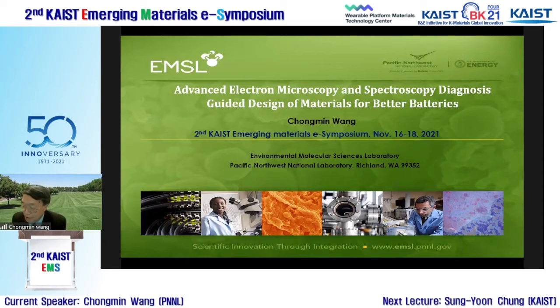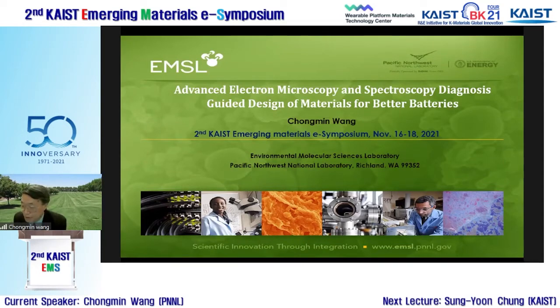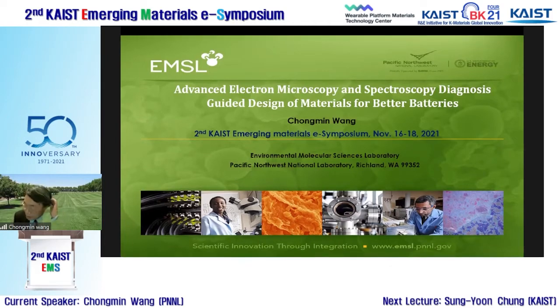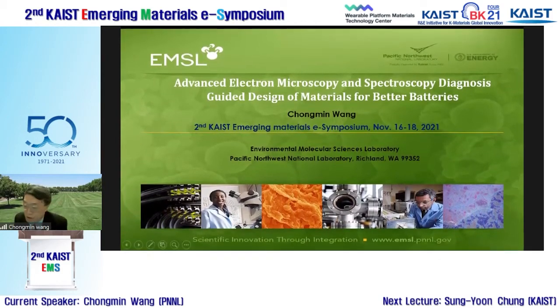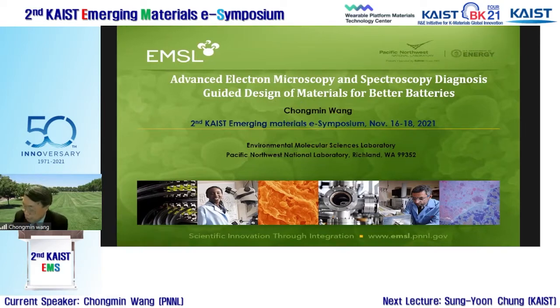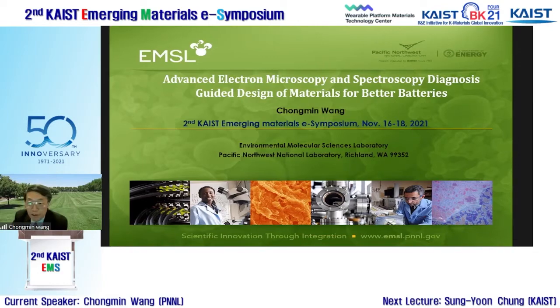Yes, thank you, Professor Kim, and the organizers for the invitation. It's a great pleasure to give a presentation and discuss what's going on with batteries, in the case of the anode and their materials. I use electron microscopy as a tool for diagnosing the battery. As you can see from my title, with this kind of diagnosis we can capture some insight and see how it can be used to guide the design of new materials for batteries.